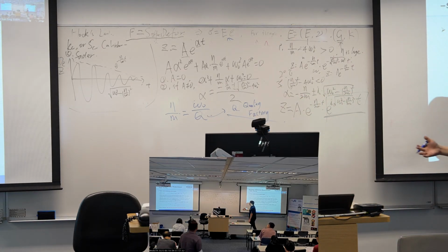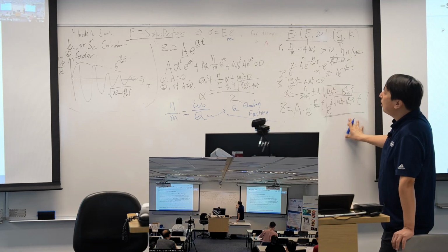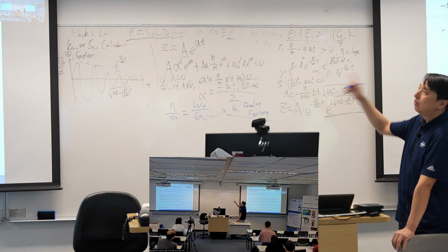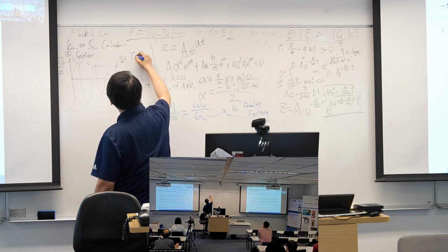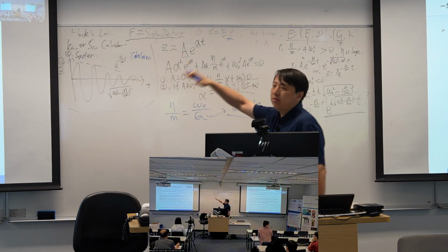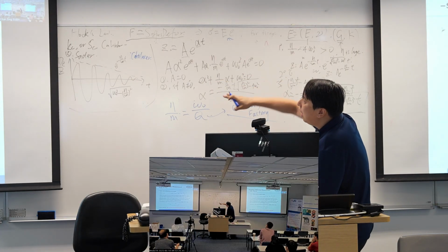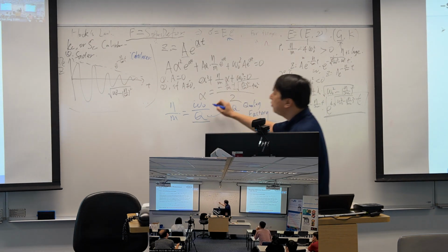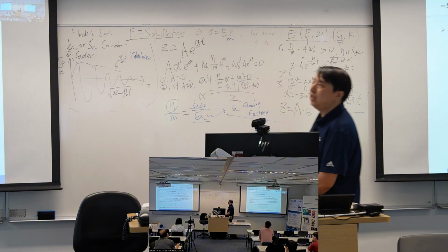Okay, so finally we get our solution. And as such, we can try to get our Kc out from this method. So we have a probe, we have our cantilever, and we put our cantilever inside the environment. It will sense a hydrodynamic force. This hydrodynamic force can be characterized using our quality factor and our resonance frequency, and our key idea is to get the eta.